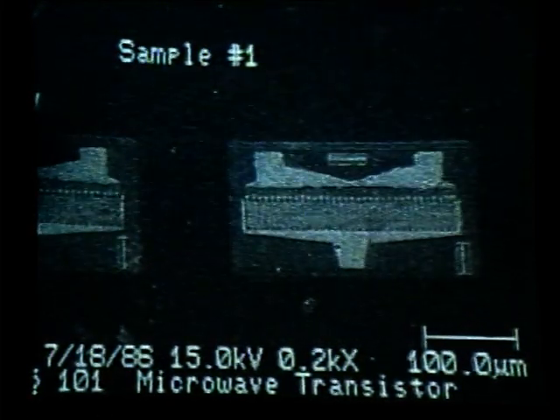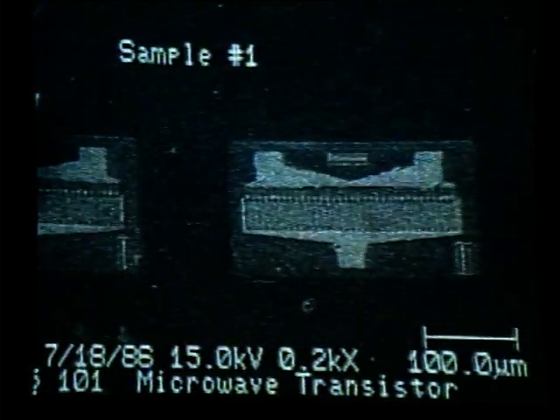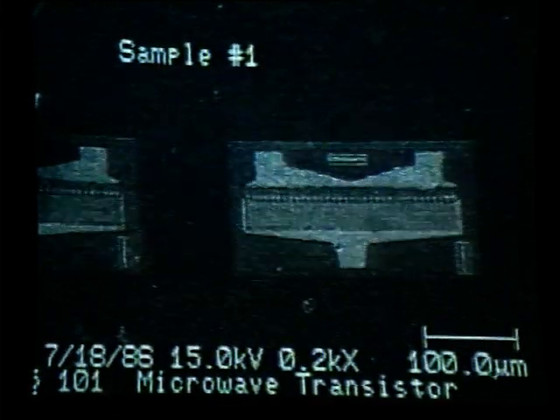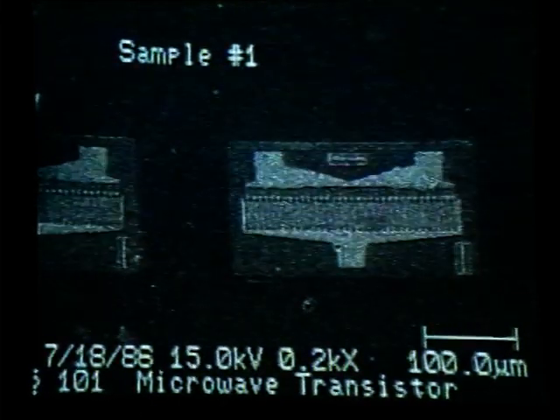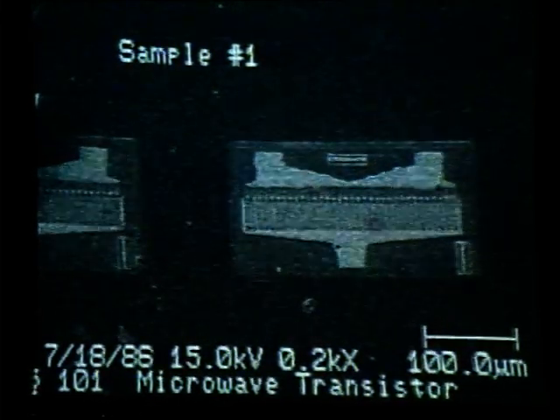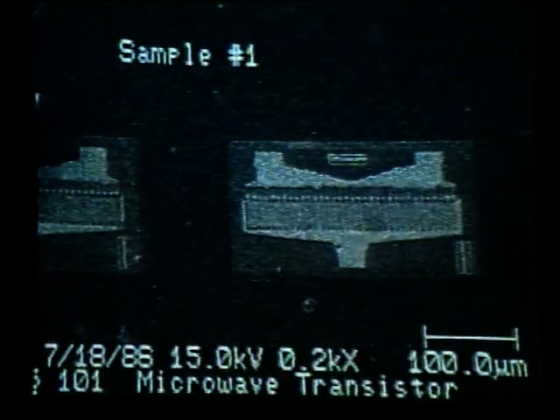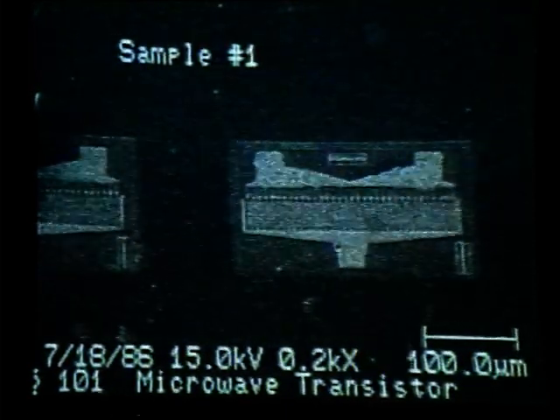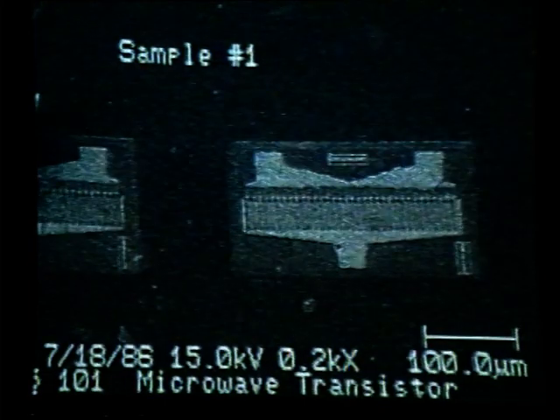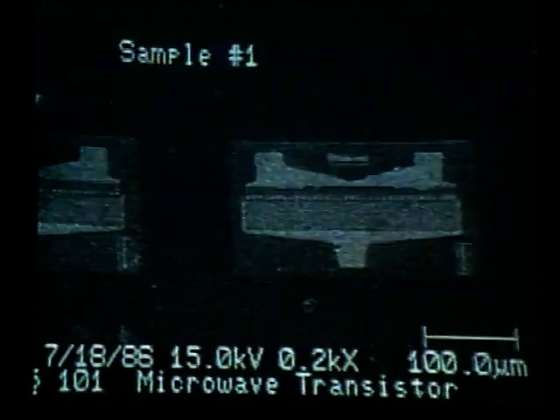We can also take photos from the SEM menu. If we were to take a photo in the SEM menu using the soft key labeled photo on page 1 of the SEM menu, any of the fields which we have turned on in this photo setup menu will remain on in those photographs, except for the digital storage monitor text annotate. Only in the setup photo mode can we access the DSM text annotate.